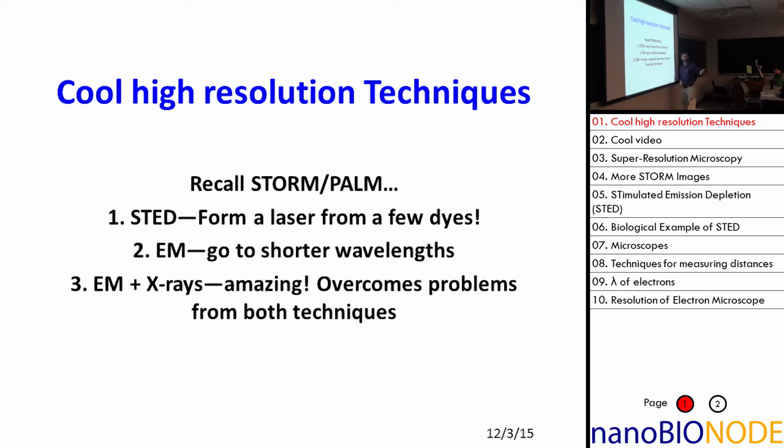There is actually another super resolution technique, which is called STED, and in fact, that also won the Nobel Prize in 2014. STED is really an amazing technique, because you label something with an individual or a few fluorophores, and you actually make the thing lase.